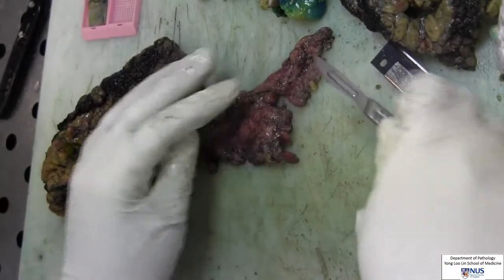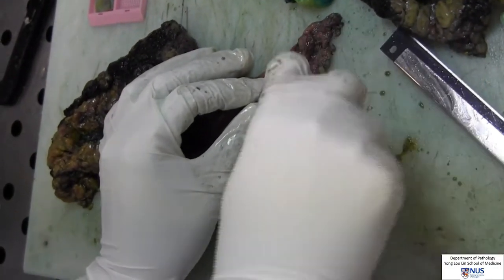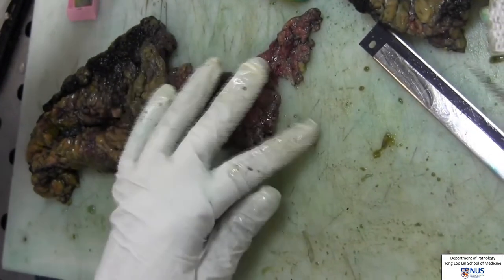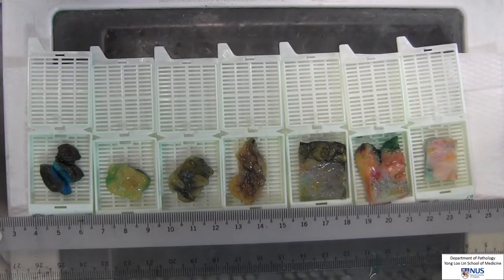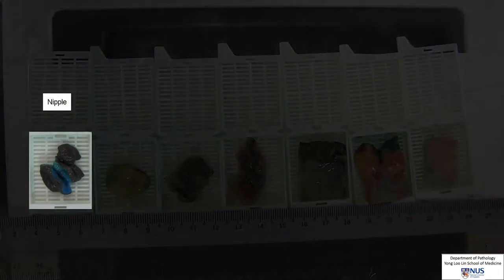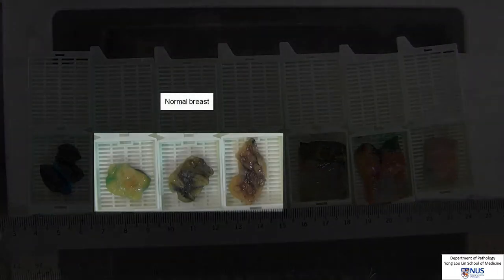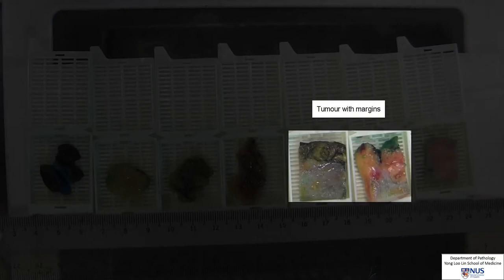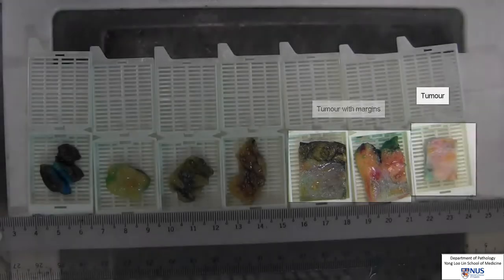Lymph nodes from the axillary tail will be sampled as well. Here we have the sections on cassettes ready to be sent off for processing into microscopic sections. To recap, here is the nipple, normal breast tissue from the three uninvolved quadrants, tumour with superior and posterior margins, and a sample of pure tumour tissue.